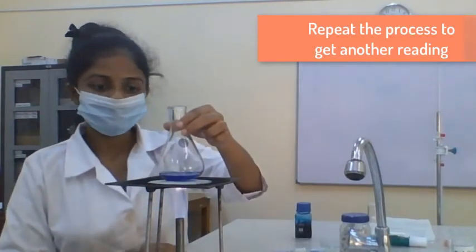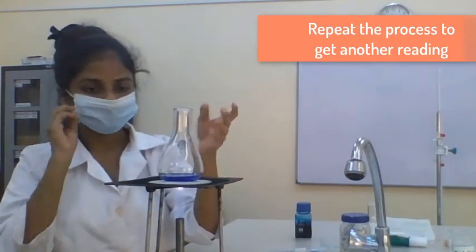Then we have to repeat the step to get another reading.